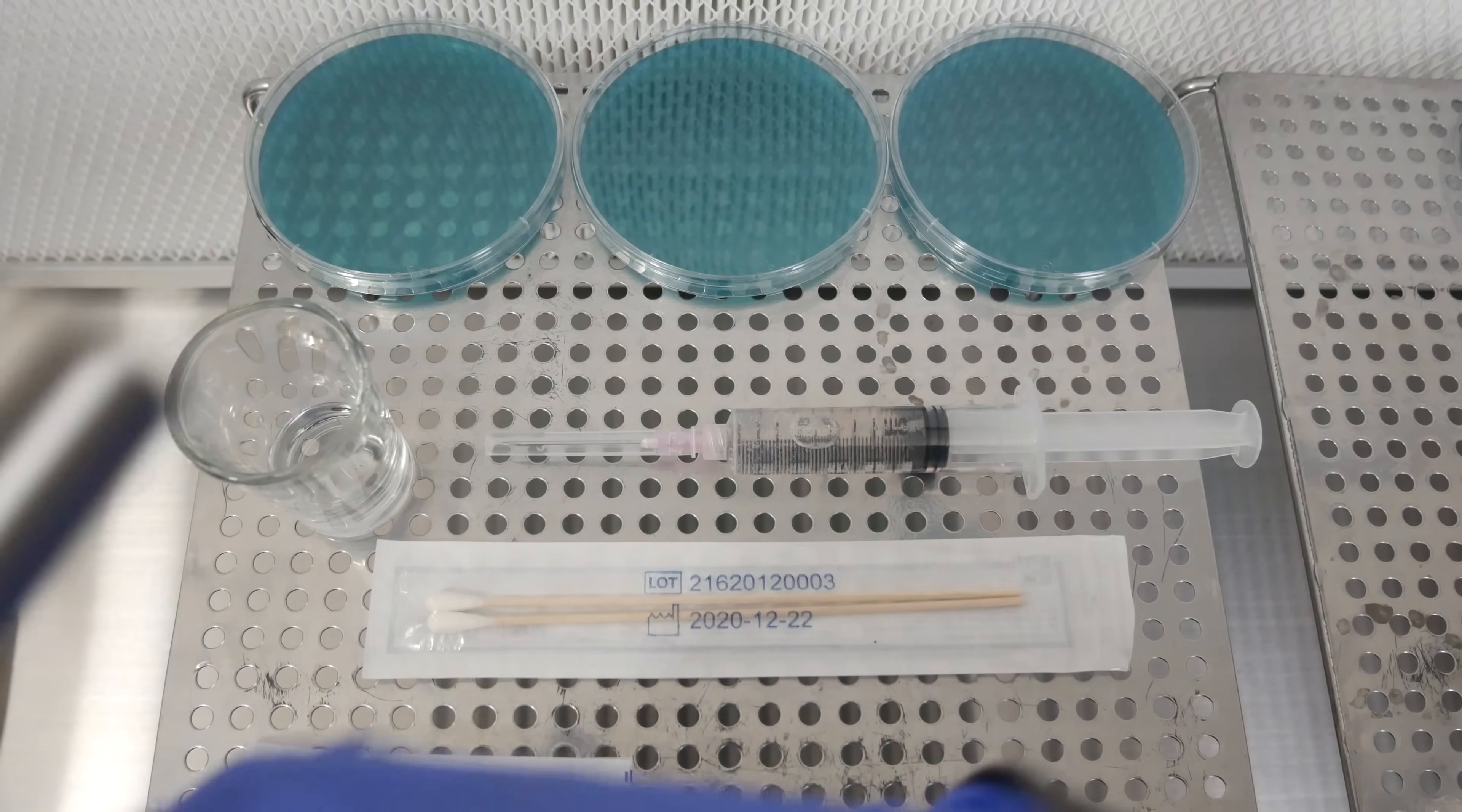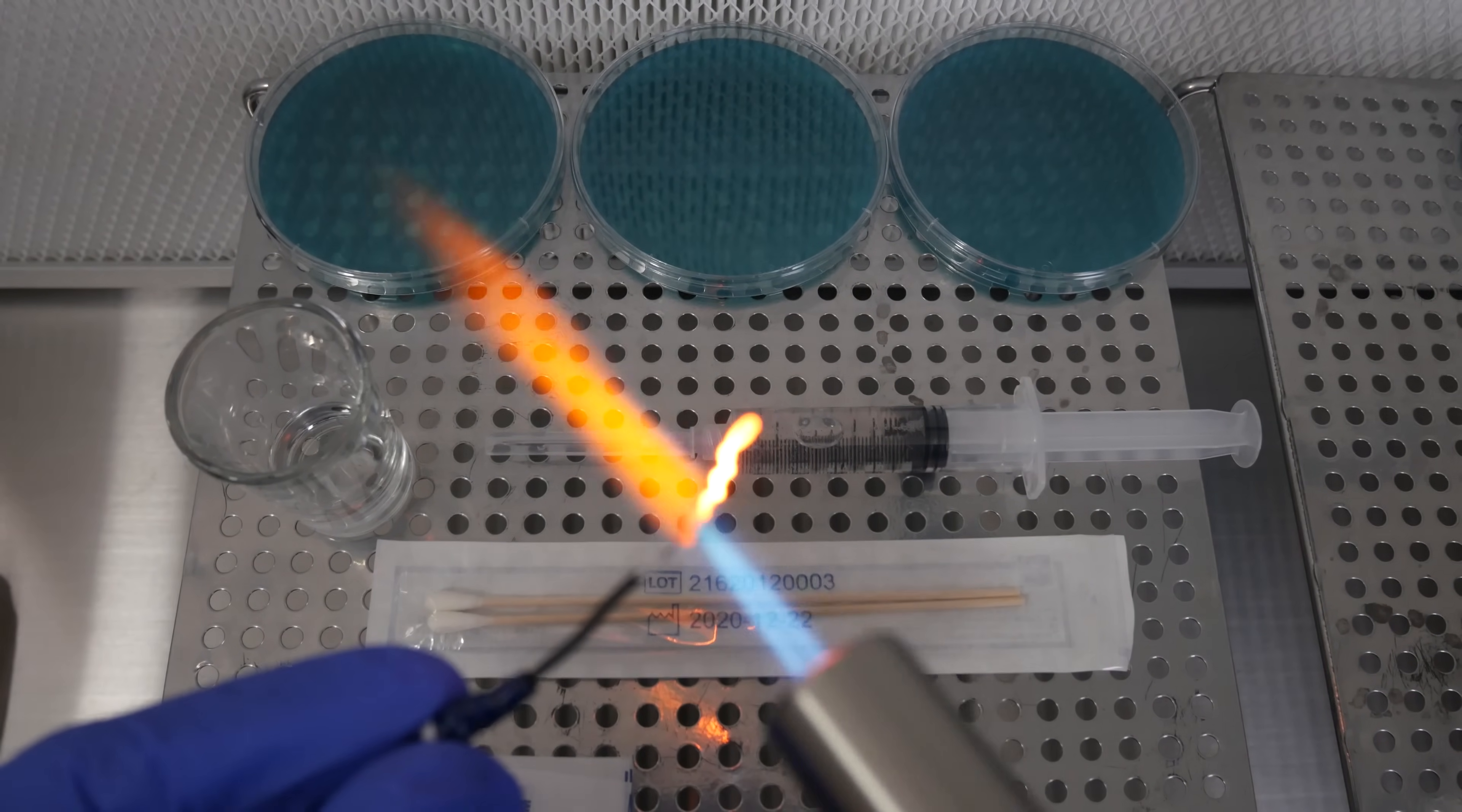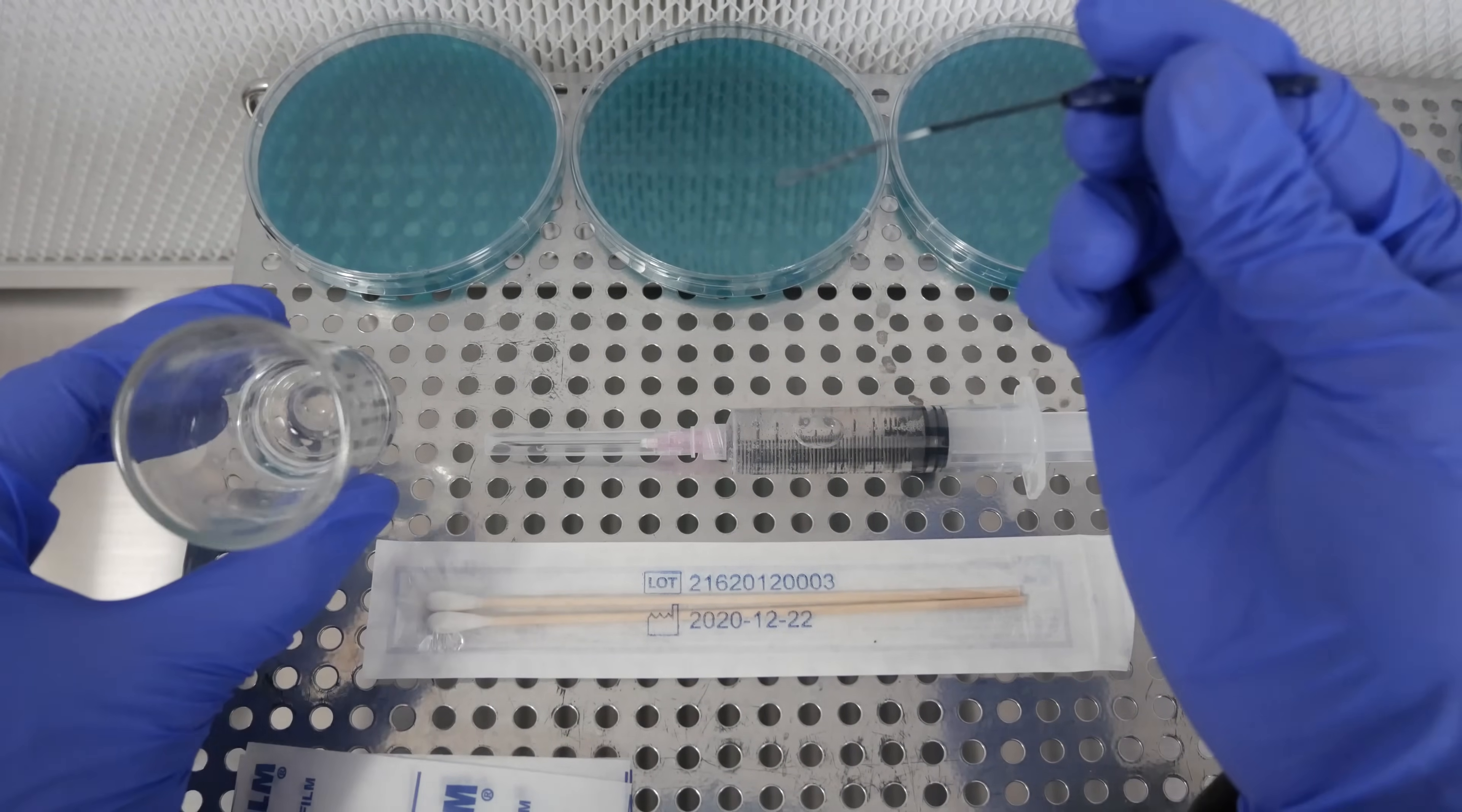The next method we'll use the inoculation loop here. What I'm going to do is flame sterilize the inoculation loop. This makes sure that any bacteria that might be on the loop is gonna be toasted. After I flame sterilize it, I'm gonna let it cool down for a few seconds here.